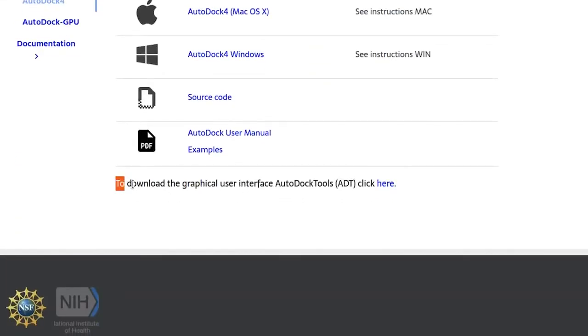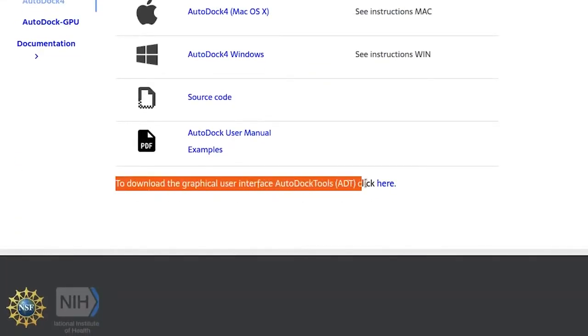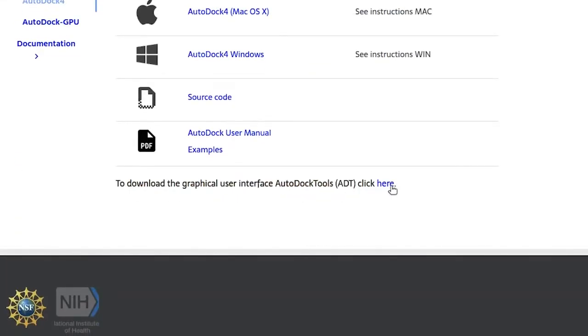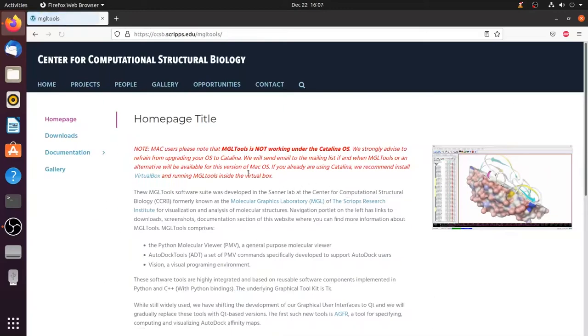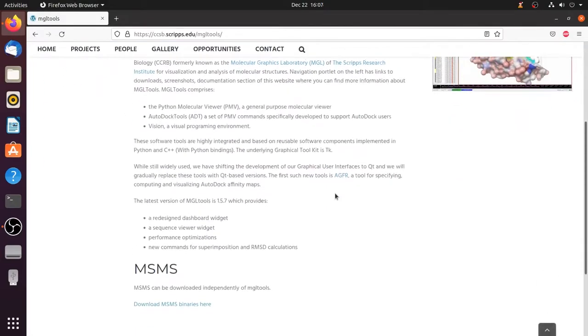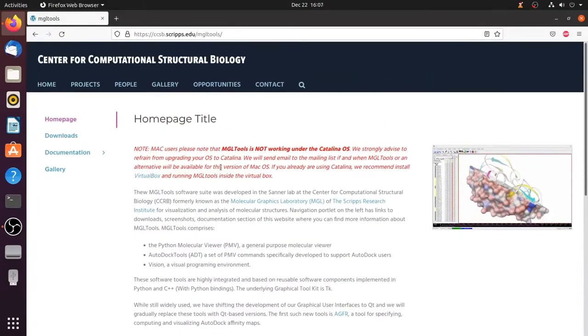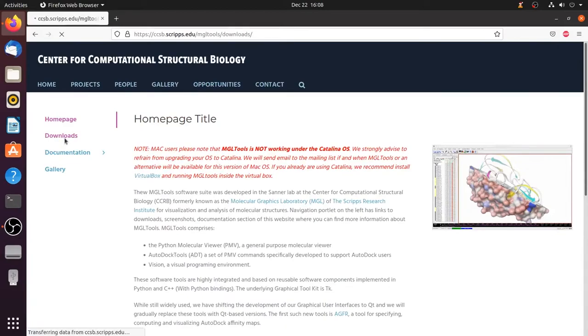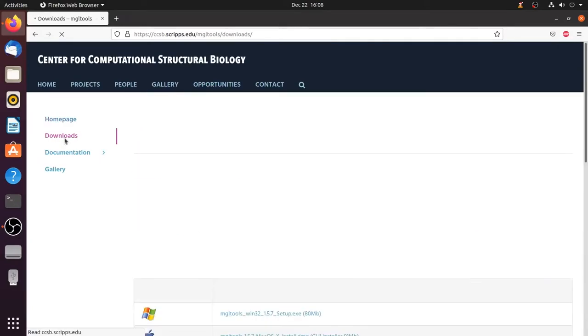Scroll down here you will find download the graphical user interface Autodock Tools. So click here. This will take you to the page Center for Computational Structural Biology. Click the download section present on the left side.